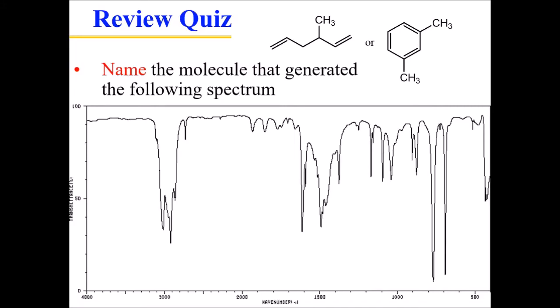For today's lesson, what I want to do is first walk through a couple of sample problems that involve IR spectroscopy, and hopefully these are much easier after you've gone through the homework of lesson 14A. This is a good example of a typical IR problem where I'm going to give you a spectrum and then give you some limited choices of molecules, and you have to decide which of these molecules is going to apply to this spectrum. IR spectroscopy is all about functional groups.